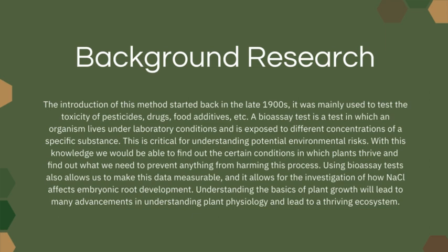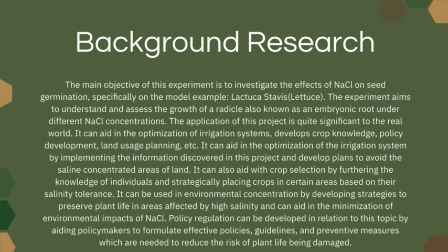a thriving environment. The main point of this project is to understand the effects of sodium chloride on seed germination, specifically on the model organism used, Lactuca sativa, also known as lettuce. This experiment aims to understand the growth of embryonic roots under the influence of different concentrations of sodium chloride.